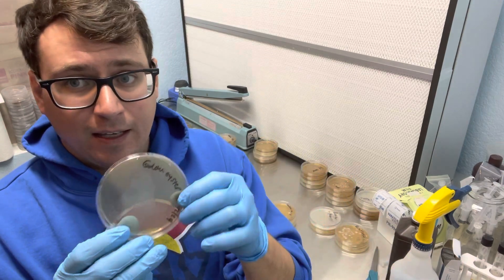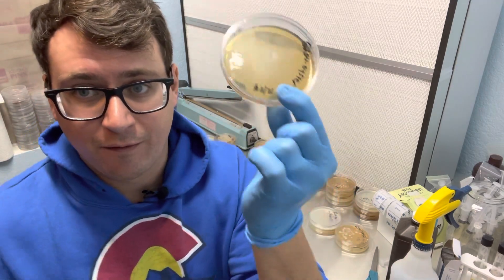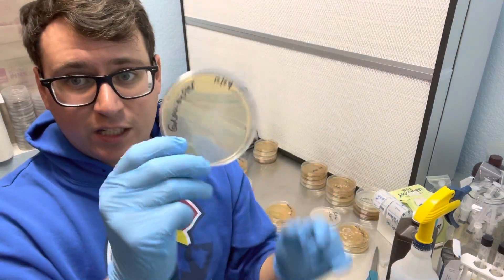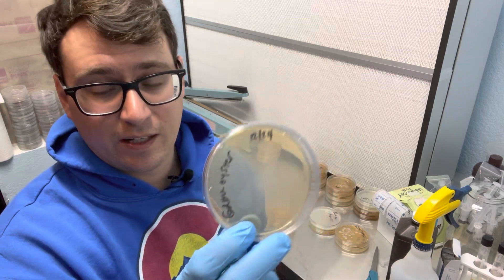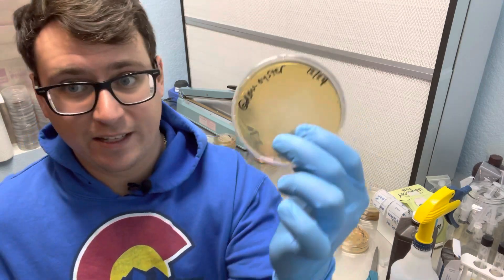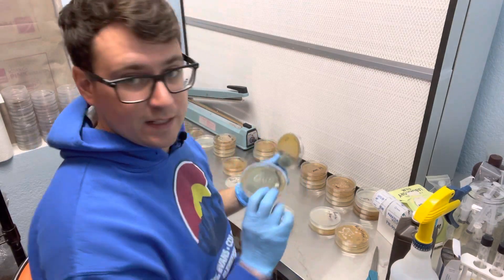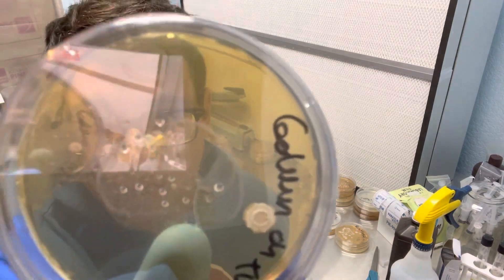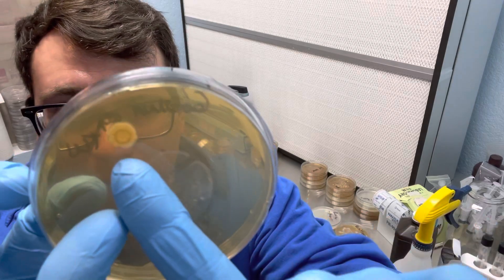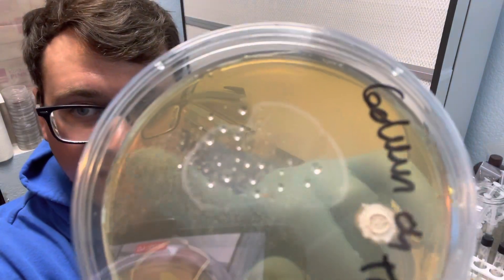So essentially with this petri dish I'm just going to let these colonies grow out, and then in about four or five days from now I'll come back and I'll start to sector off different phenotypes from this petri dish. This is five days in, we've already got spores, and there's two different phenotypes of golden oyster. This was one of my lowest yielding strains last summer, so I'm really excited to get this new golden oyster variety.